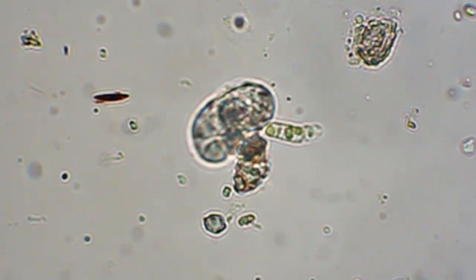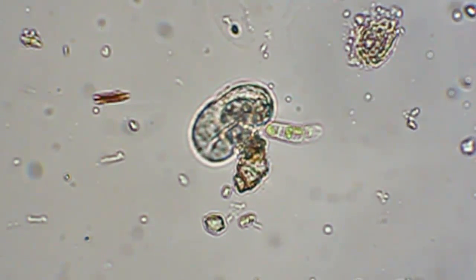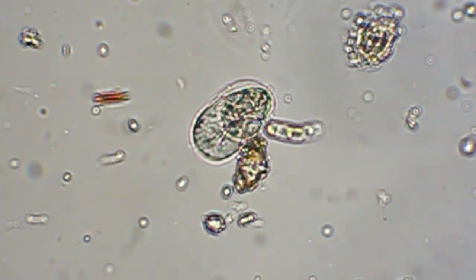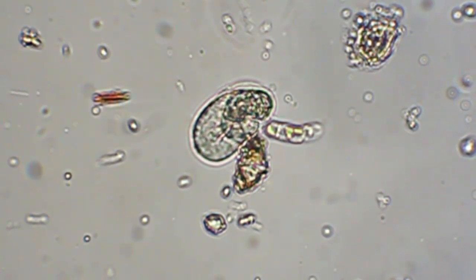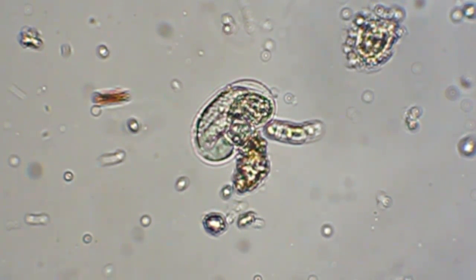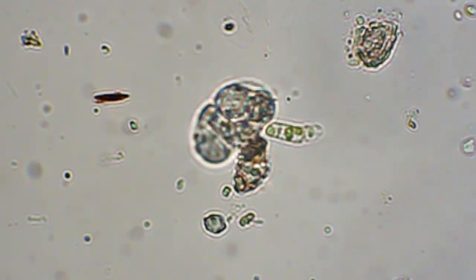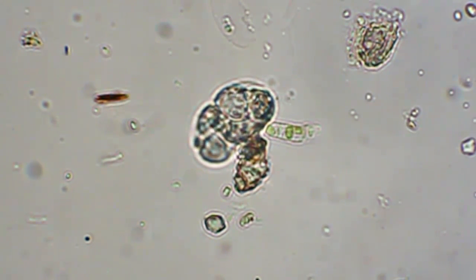Getting some depth — this is really about the limit of my magnification right now. I've never seen anything quite like this, and this thing beside it with the three or four cells and the green things inside each cell — I haven't quite seen anything like that before either.